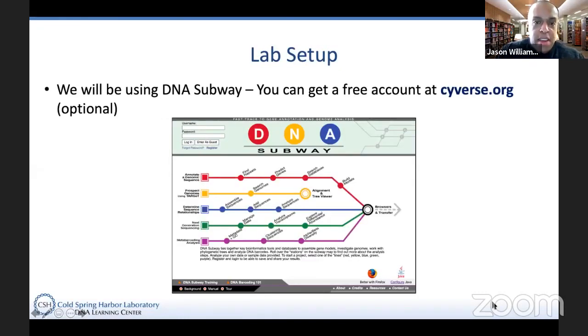You'll want to go to DNA Subway, which you can Google, or go to cyverse.org. We recommend you get an account, but it's not required. If you get an account, your work will be saved. But you can also go ahead and follow along, even from today, using a guest account.